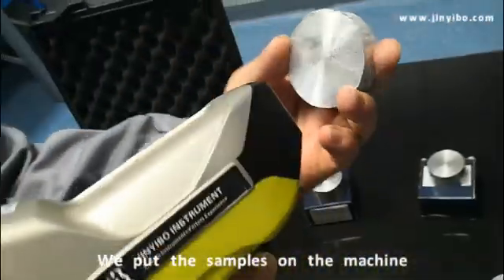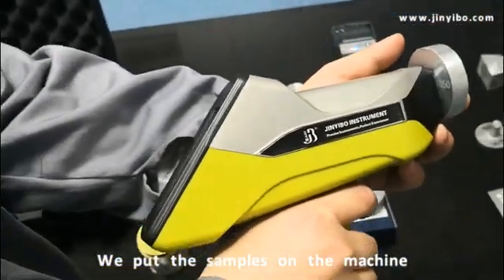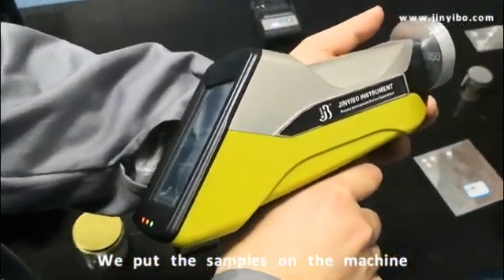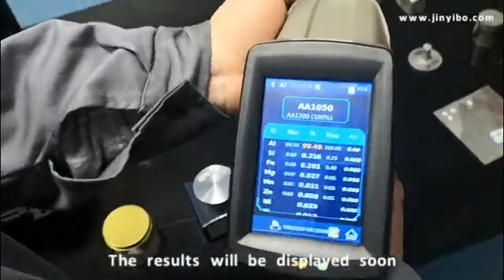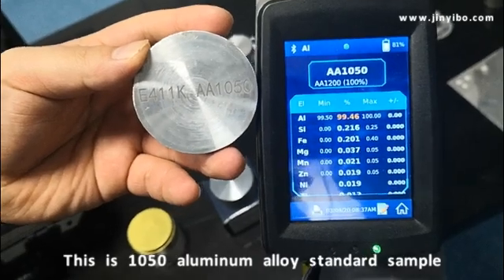We put the sample here at front. Just one second — the result is out. It shows you this as 1050.